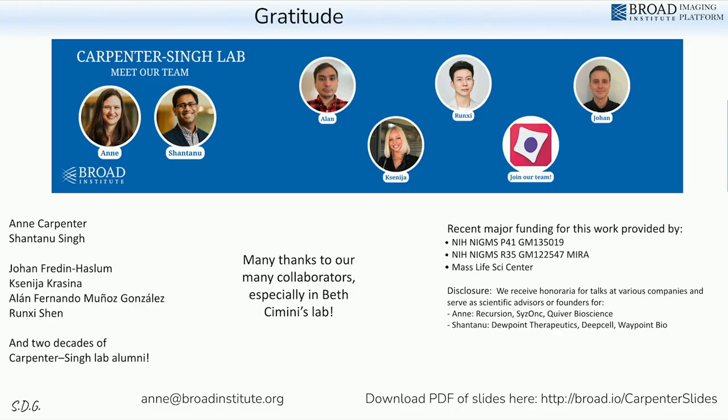Part of the hesitation of switching entirely to bright field, so I should say, in JUMP Cell Painting, a good proportion of the partners were able to include bright field, so maybe half of the sources, half of the data will have a bright field alongside, usually a 3-stack Z-stack is provided. So that data exists for people who want to play around with exactly this question. But I think the key challenge is how do you train the model to get as much out of bright field as you would like.